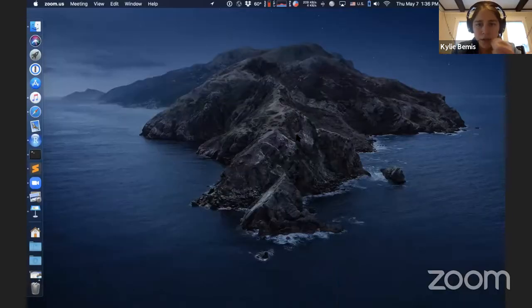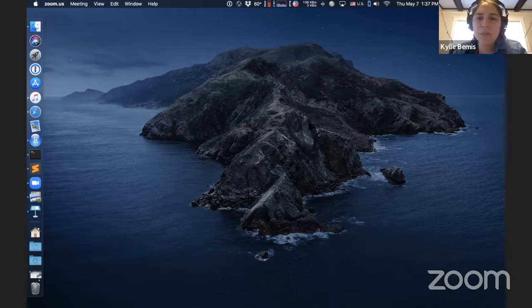And there's a question, what's the difference between peak bin and reduced dimension? So in older versions of Cardinal, there is a method called reduce dimension that worked on an MS image set. Newer versions of Cardinal use an MS imaging experiment object rather than the MS image set, and the reduce dimension method is no longer used. So what peak bin here does is it uses a list of reference peaks. This can either be something that was generated from the data set itself or a list of external reference peaks. And then it essentially goes down the spectrum and finds the boundaries of the peak and bins the intensities based on those peak boundaries.